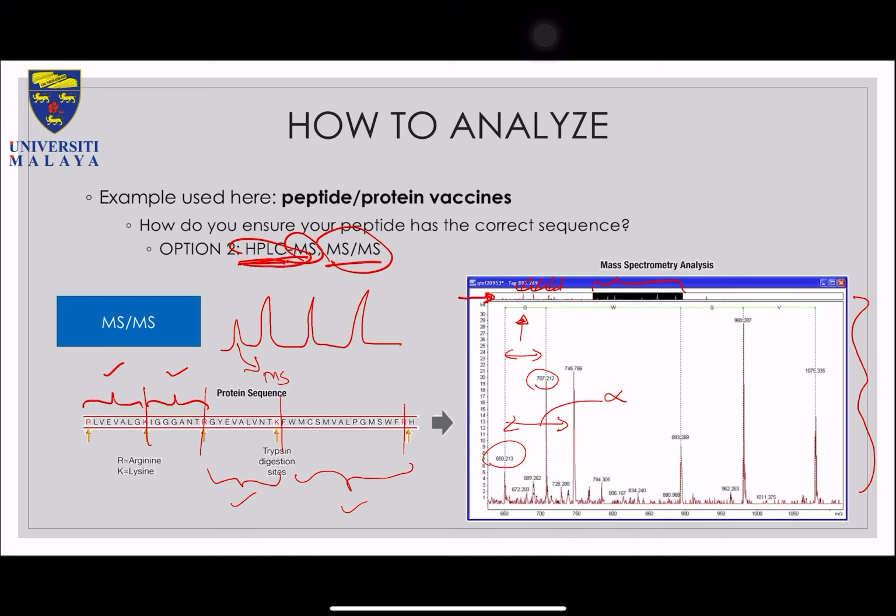But as part of the training, we normally look at all possible mass differences. For example, what I'm drawing here is the mass difference between 650 and 745, which has no corresponding mass to an amino acid.